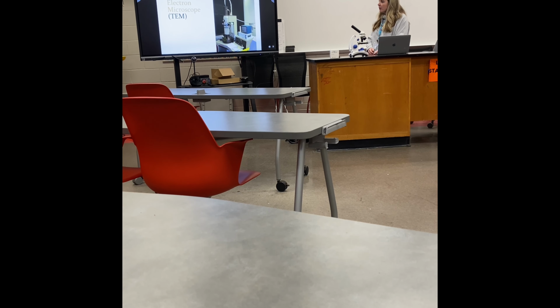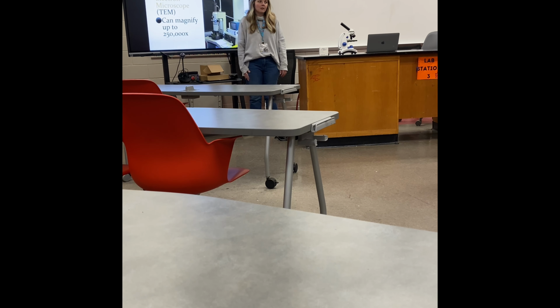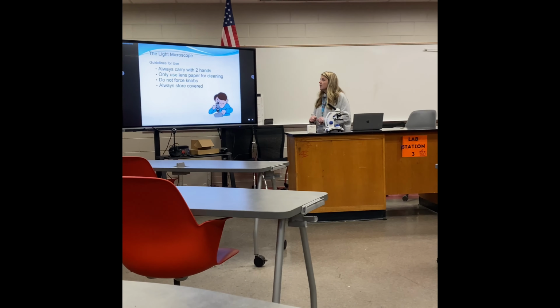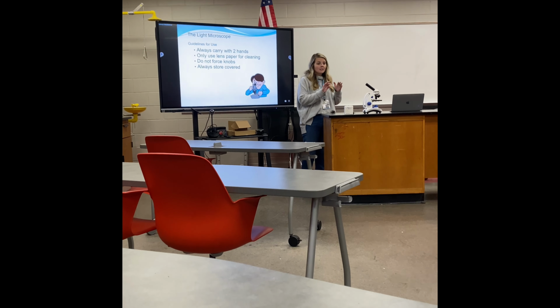Transmission electron microscope, much of the same concept as a scanning electron microscope. We can see magnifications up to 250,000 times. Wow. Imagine the end of this paper clip magnified 250,000 times. Okay, so we're going to actually look at the compound light microscope and identify some of the pieces and the parts to it, okay?